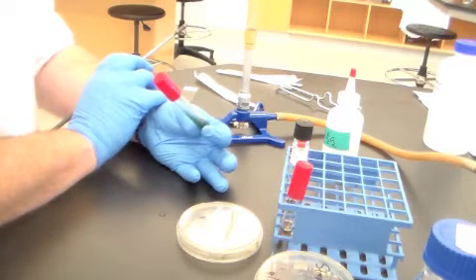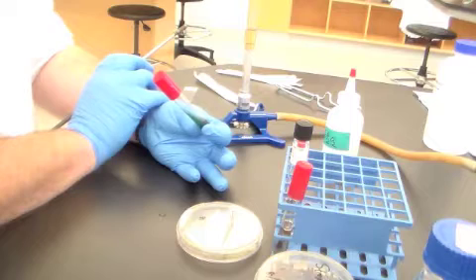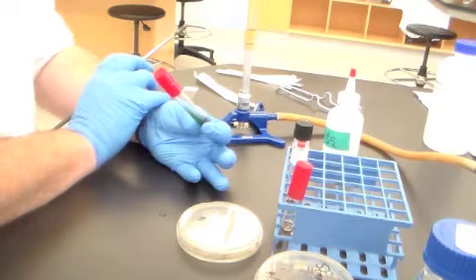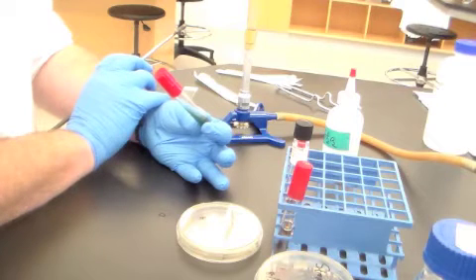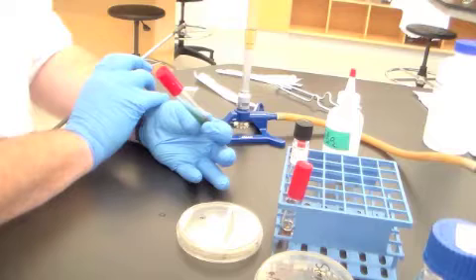And what we also very importantly know is that the only carbon source in here is citrate, citric acid. So we're assaying for the bacterium's ability to use citrate as a sole carbon source. And that's a slightly unusual phenotype among bacteria. So as a diagnostic test, this is a very important test.